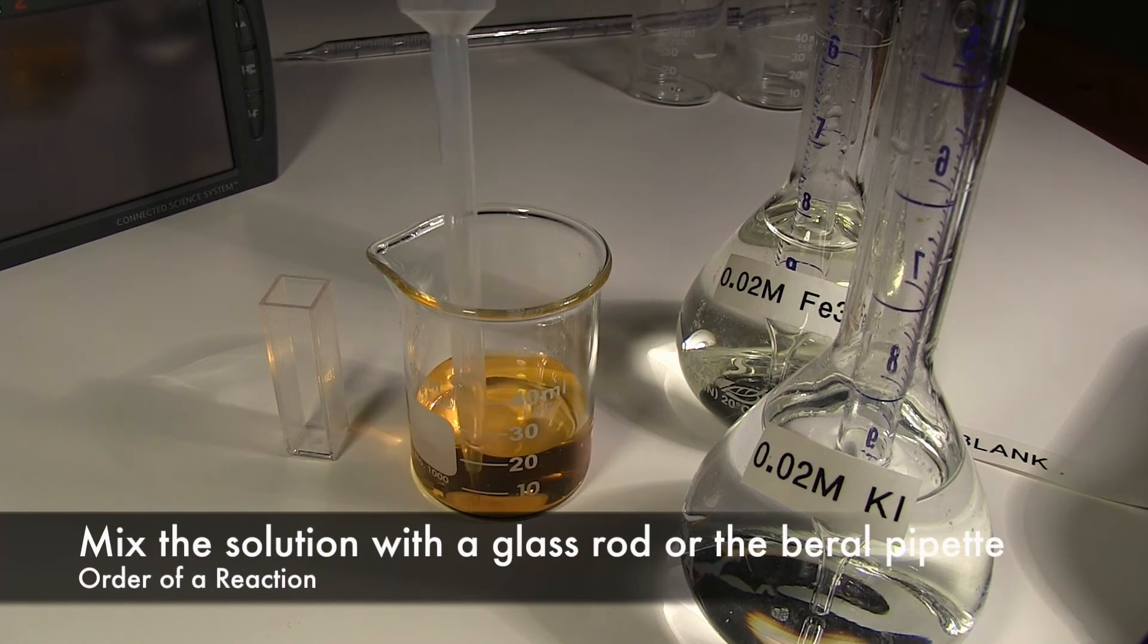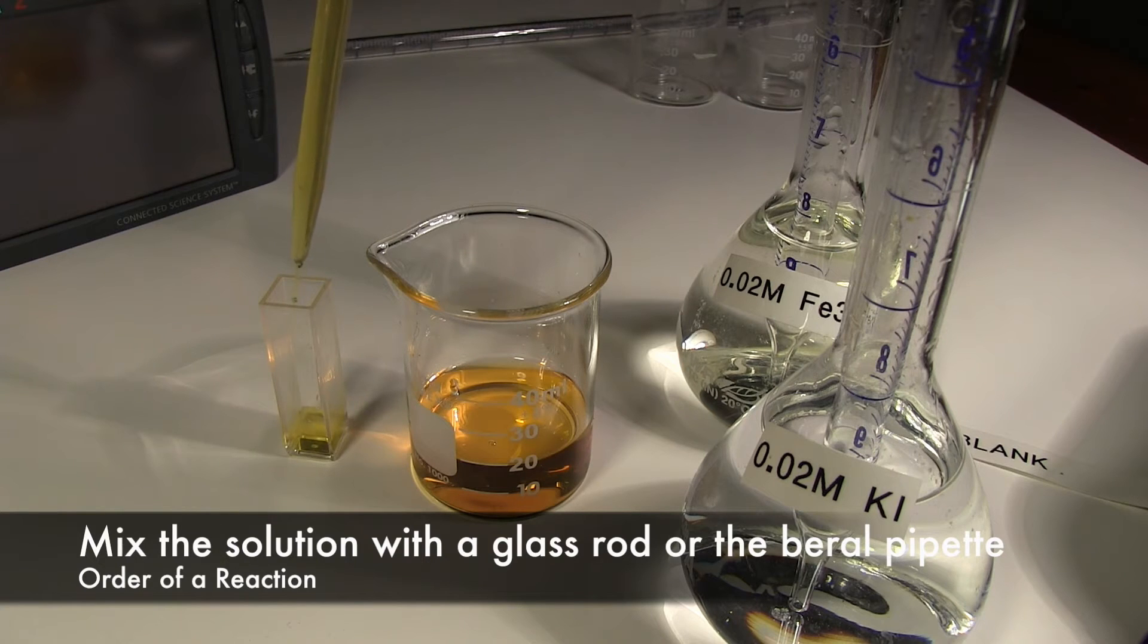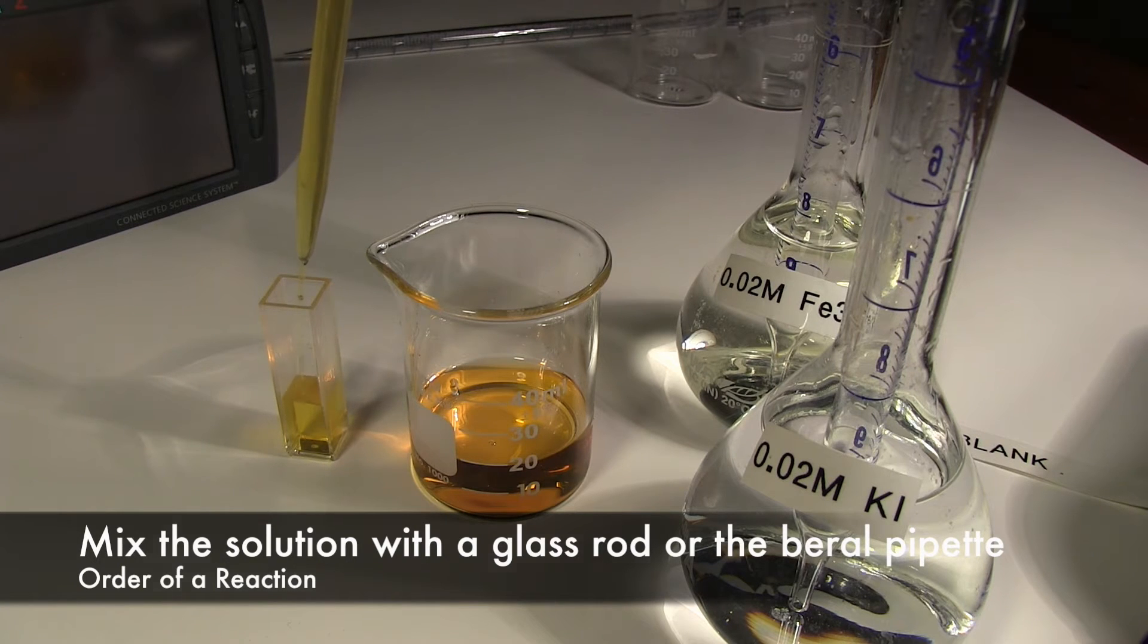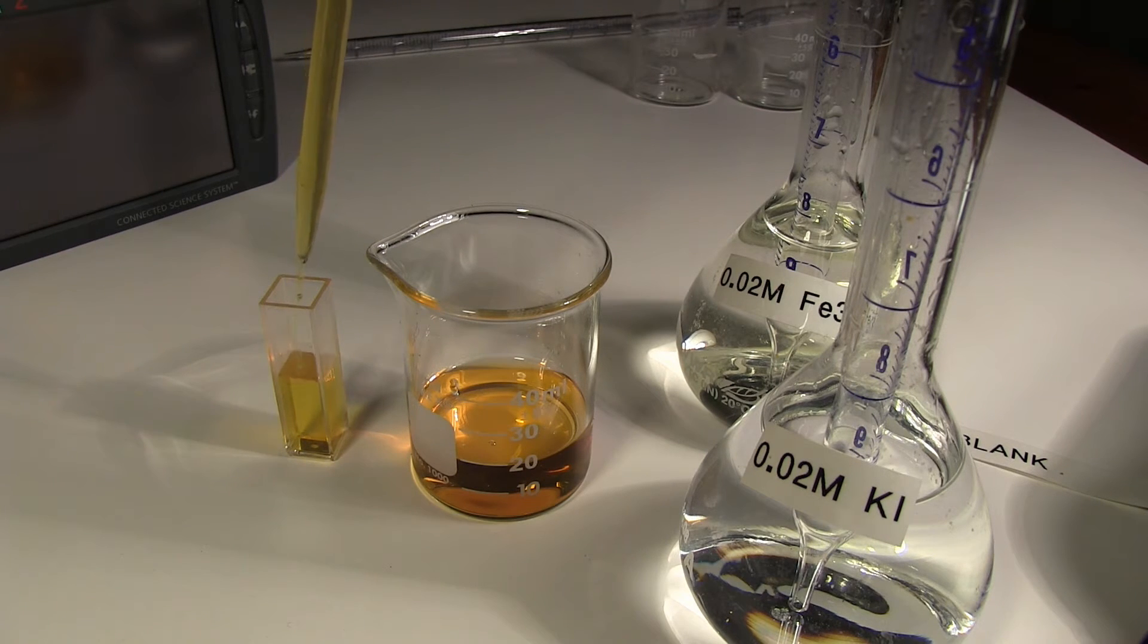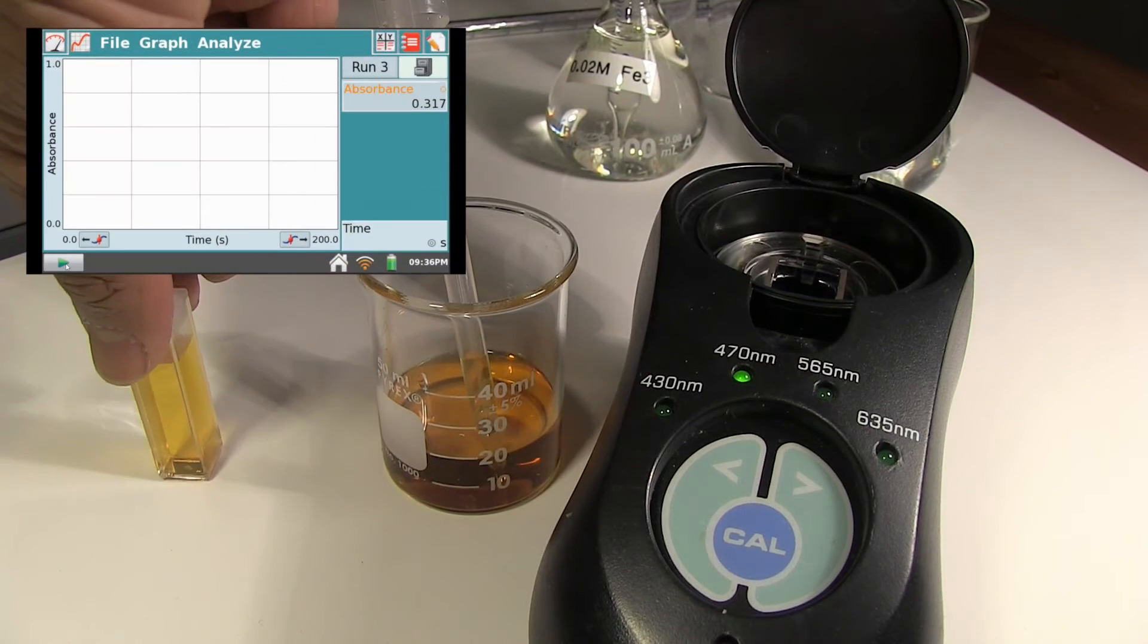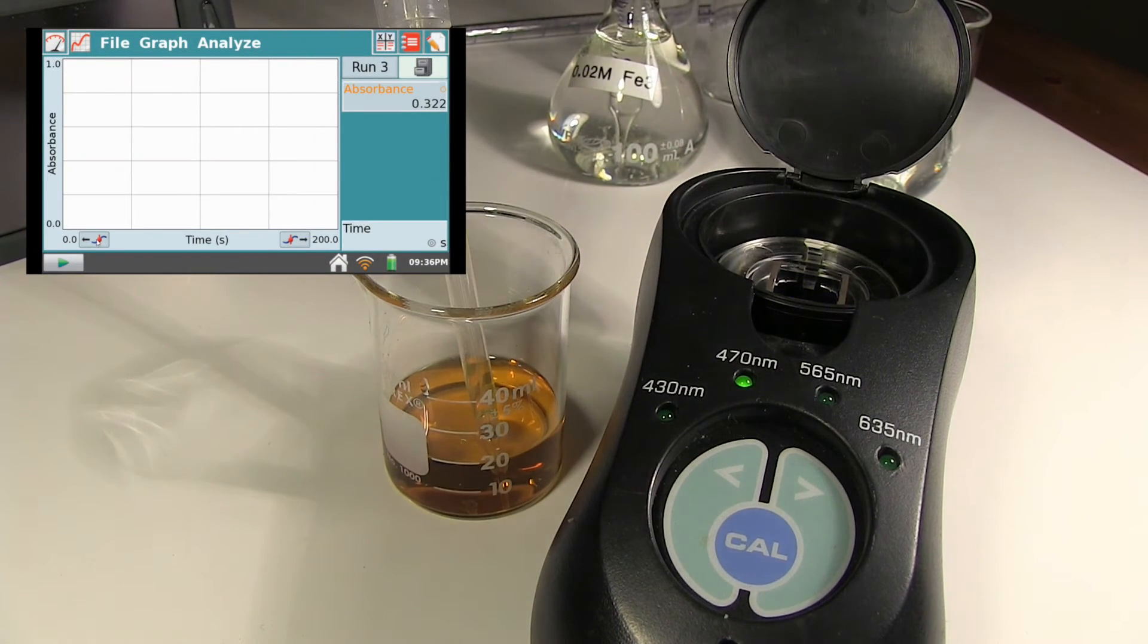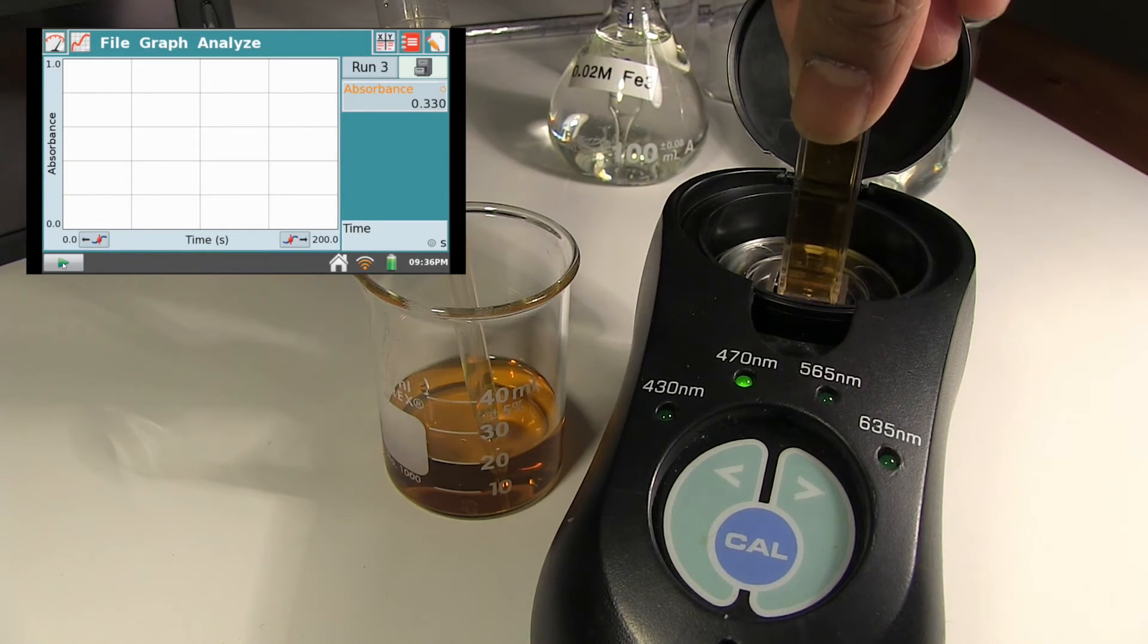Mix the two solutions properly using either a glass rod or the beryl pipette. Transfer the solution to a clean cuvette using the beryl pipette. Place the closed cuvette in the colorimeter as described earlier. Close the colorimeter.